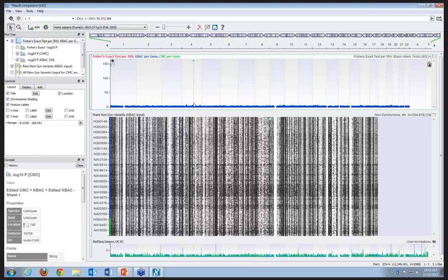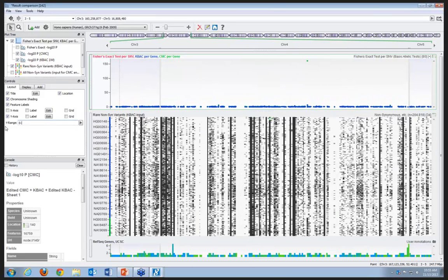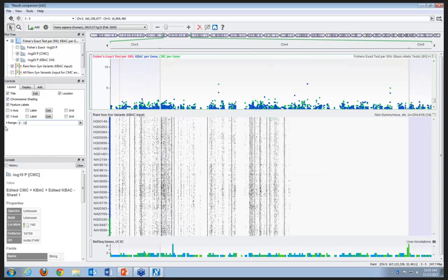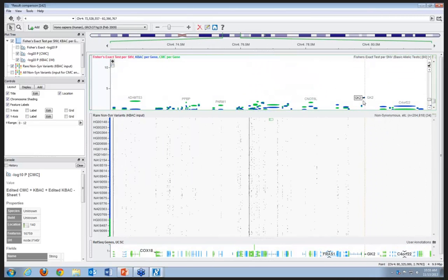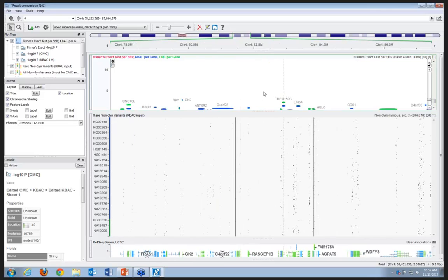It's maybe a little bit overdone here. But in general, if we zoom back in and look a little bit closer, and I'll just adjust the range a little to see some of the lower p-values. In general, the two tests kind of agree, but it's important to remember that they are not identical tests. One is including some rare variant or some common variant contribution together with the rare.